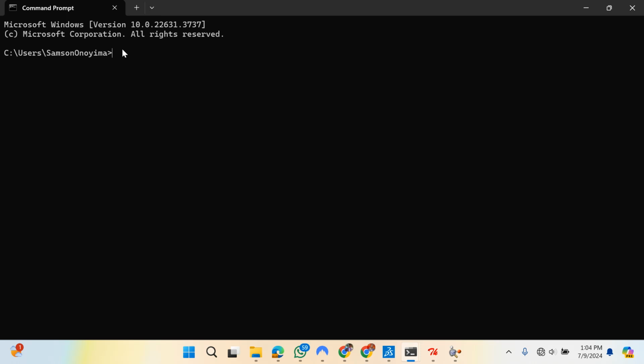So what you do here, you simply bring in the tool, which is the software, the Autodock Vina, then bring in the file you want to dock, and tell it, after docking, give me a product in this. That's all. So whatever we are going to be doing here is just to locate the file, locate the folder, and locate the software, and that's fine.